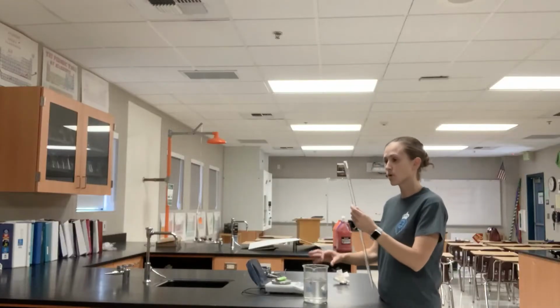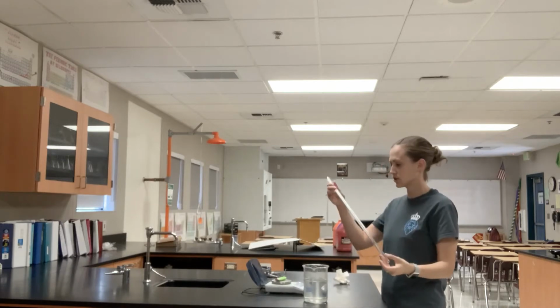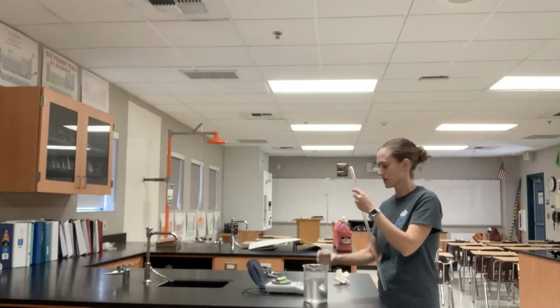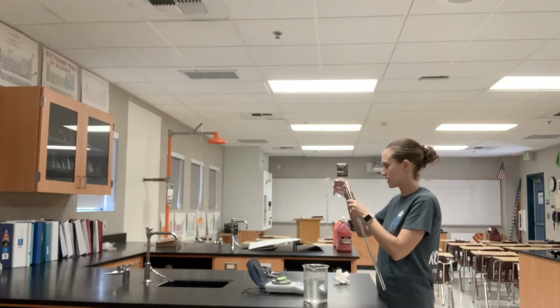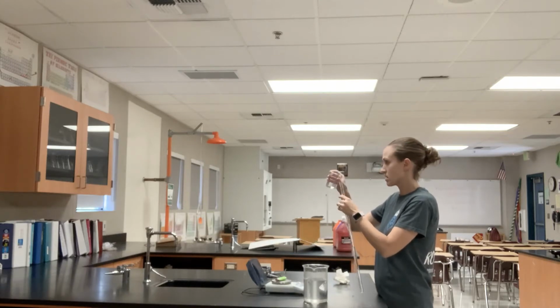All right, now I need to pour water into my eudiometer. This is a eudiometer. It is a one-sided tube, so I'm going to pour my water in as carefully as I can, and fill it all the way up to the top. The value of having a eudiometer is that when I expel the gas from the lighter, I can measure the volume of gas I expel simply by collecting it all in the eudiometer. So I need to make sure that the water is filled all the way up to the top.